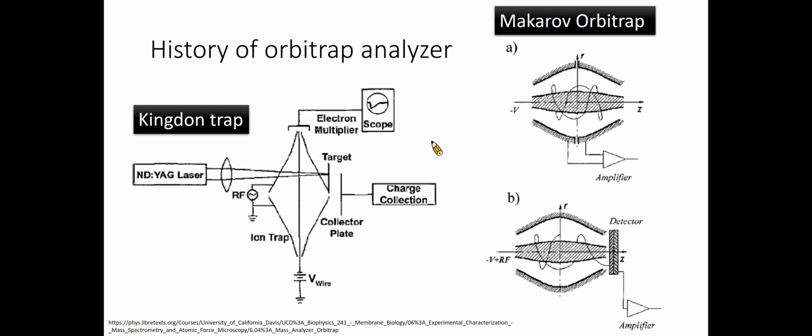The Knight trap improved upon the Kingdon trap's limitation by deriving the mass-to-charge values from electrical potentials. R.D. Knight was able to create the connection between the electric potential of an electrode and the mass-to-charge ratio. The Knight trap still had its limitation. It had issues in discriminating between similar mass-to-charge ratios, and the focus of R.D. Knight's work was on ion ejection from the Knight trap.